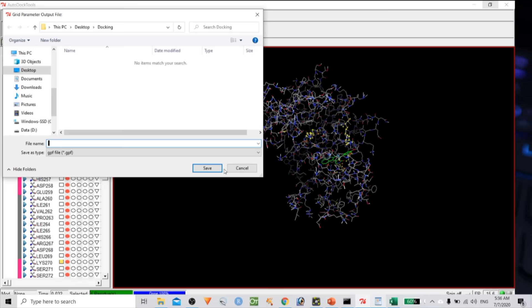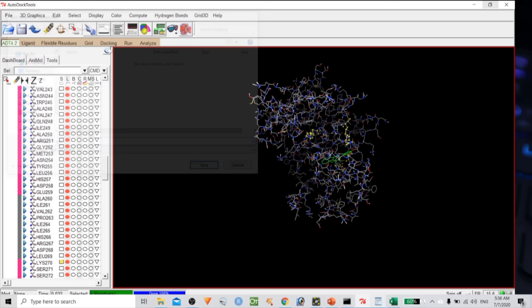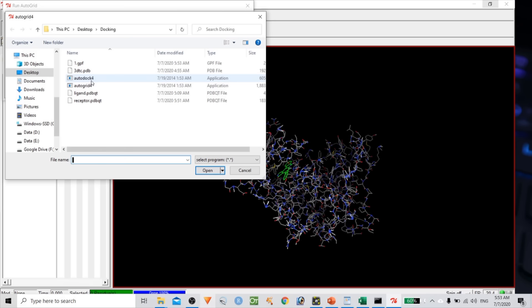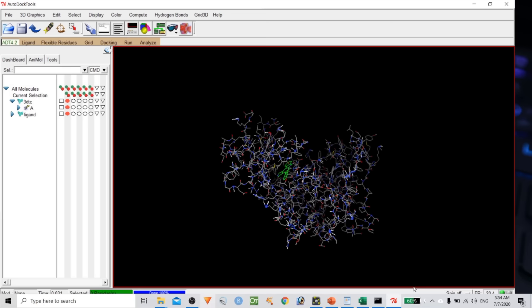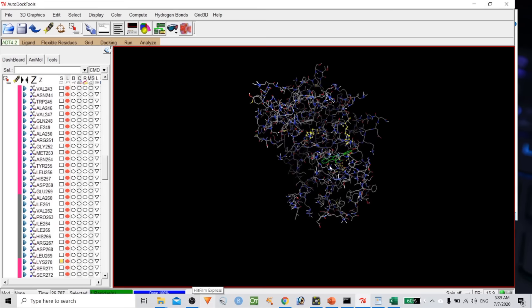Go to Run > AutoGrid, click Browse, select AutoGrid4, choose the GPF file, and click Launch. The AutoGrid program will run and generate the grid log file. Once the window closes automatically, the grid log has been created successfully.